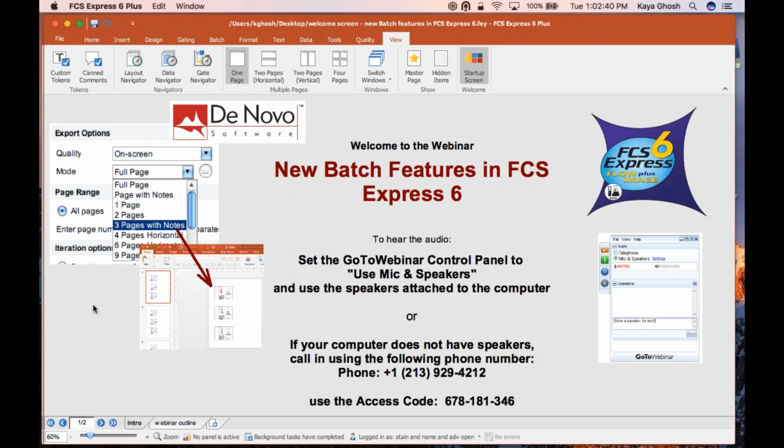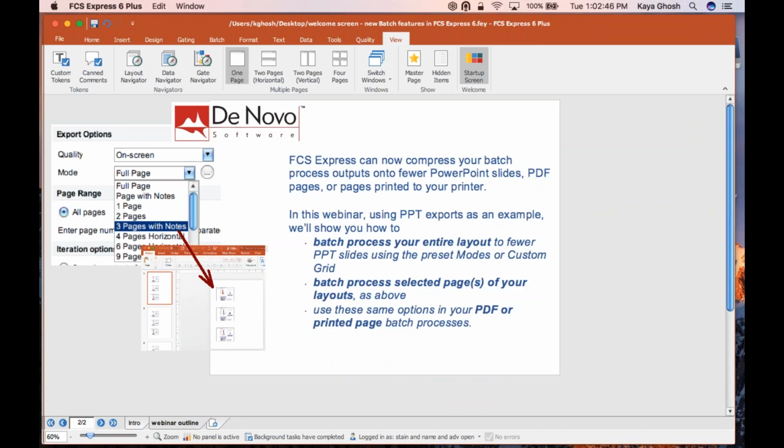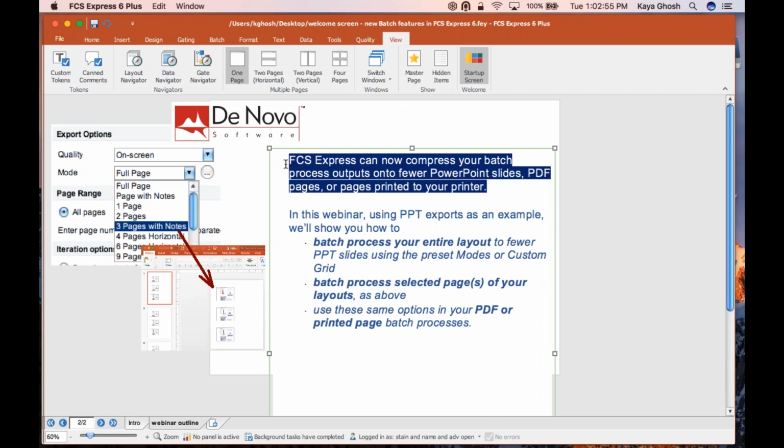And again, for those of you who are just logging on, just feel free to enter your questions in the questions and answer box. In a little bit more detail, FCS Express can now compress your batch process outputs onto fewer PowerPoint slides, PDF pages, or pages printed to your printer.